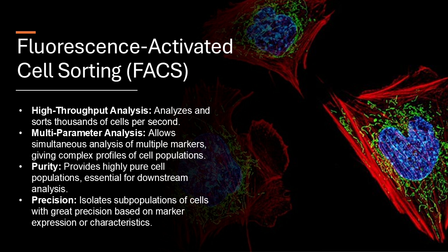Exactly. Another challenge is the cost and complexity of the equipment. It takes specialized training to operate and maintain it, which can limit access for some researchers. However, technology is always advancing, making FACS more user-friendly and accessible. That's good to hear. It makes sense that these powerful tools become more available as the technology gets better.